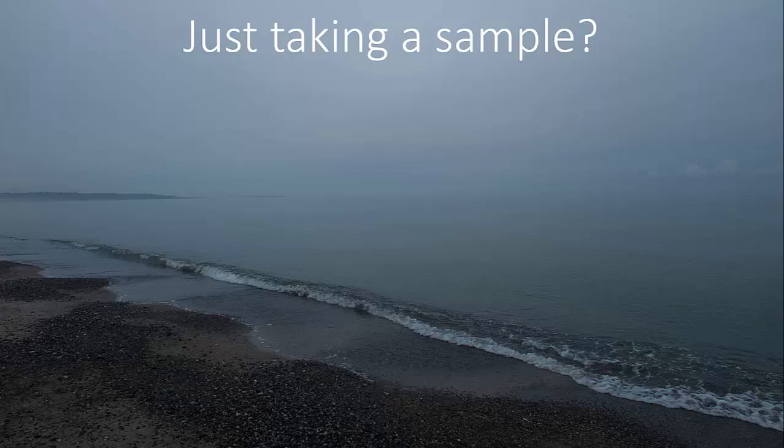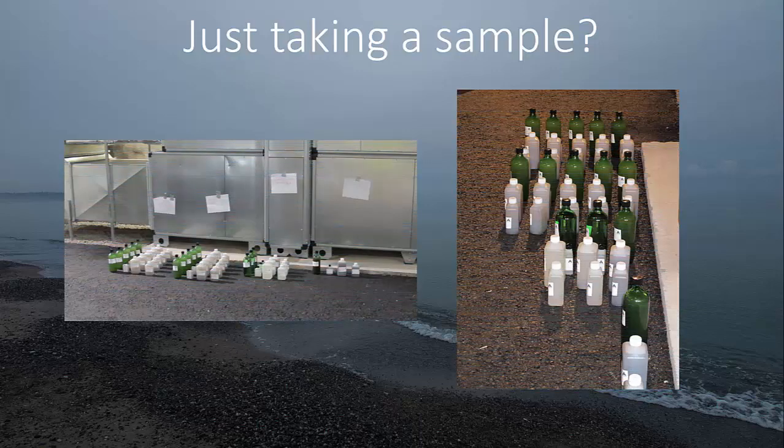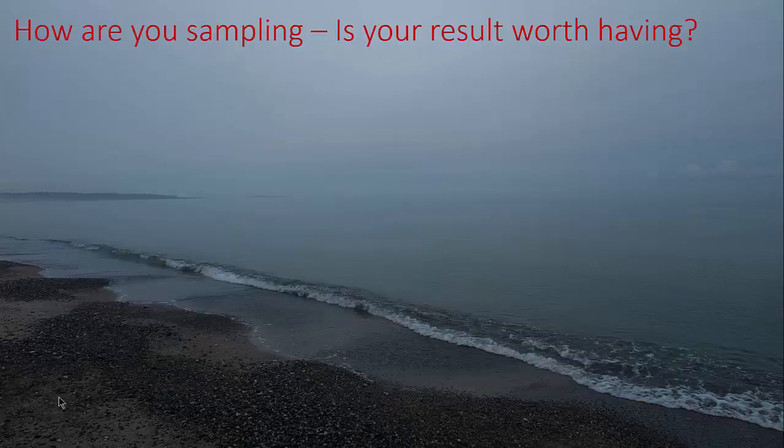You hear the expression, take a sample and check it. Is it so easy just to take a sample? What do you need to know before you take that sample in order to rely on the answer? How are you sampling? Is your result worth having? Well, let's take a look at some questions before we start answering that question.